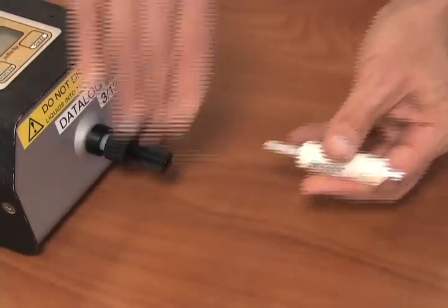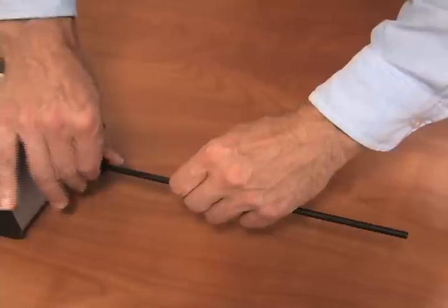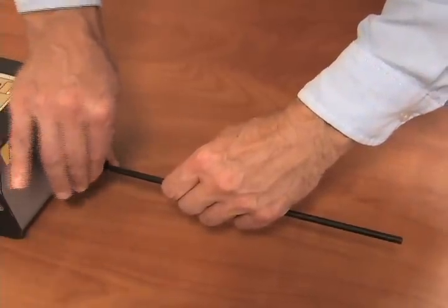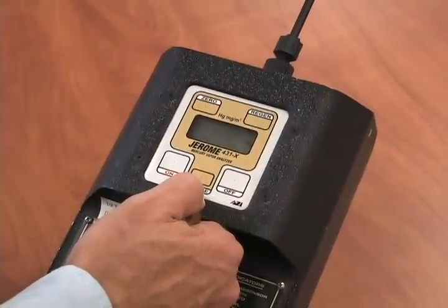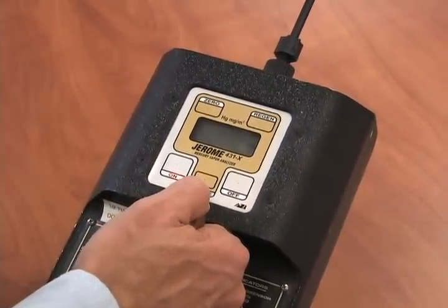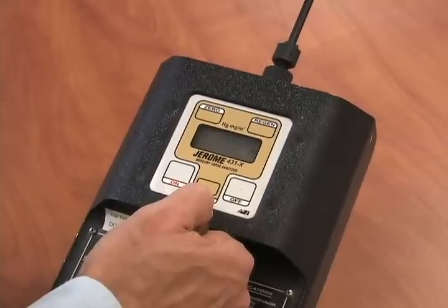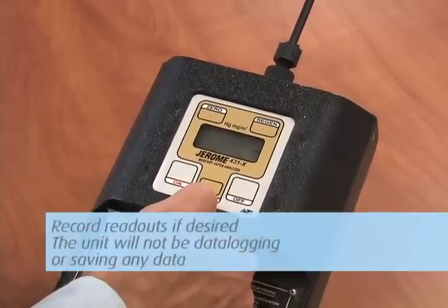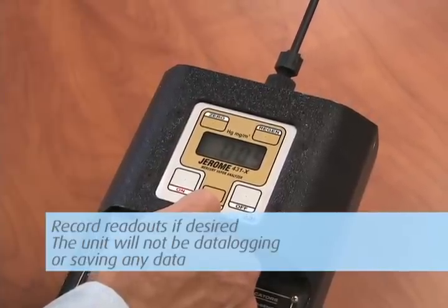To start your survey, connect the probe and turn the unit on. To collect a sample, point the probe where you want to draw your sample and push the sample button. Go on to the next location and repeat. Continue until done. Record readouts if desired, as the unit will not be data logging or saving any data.